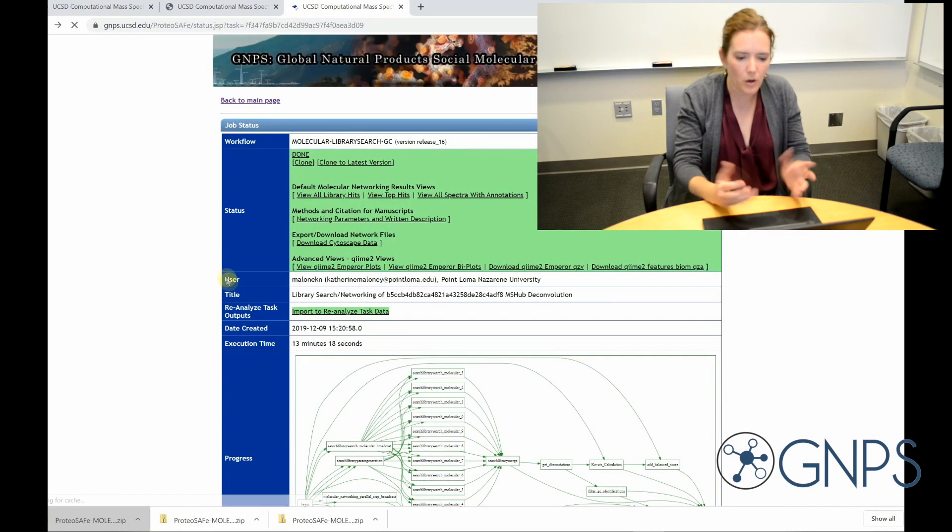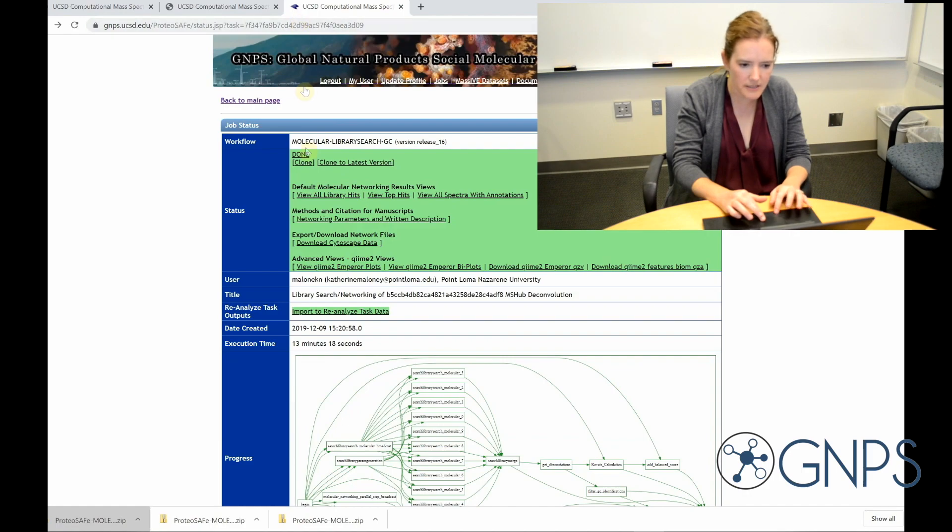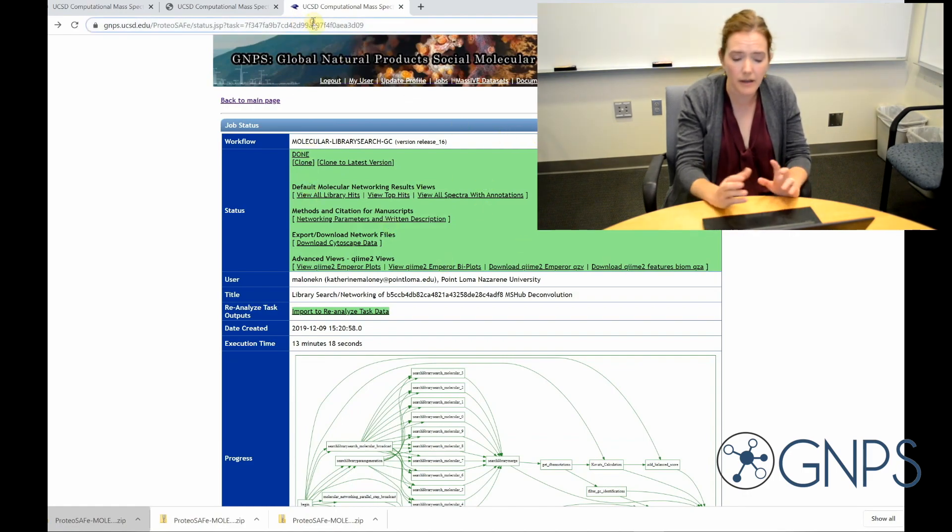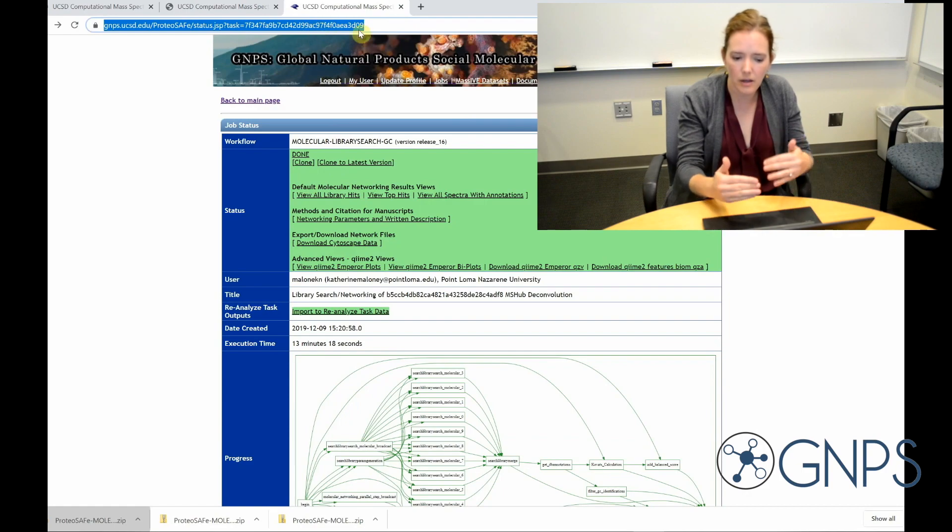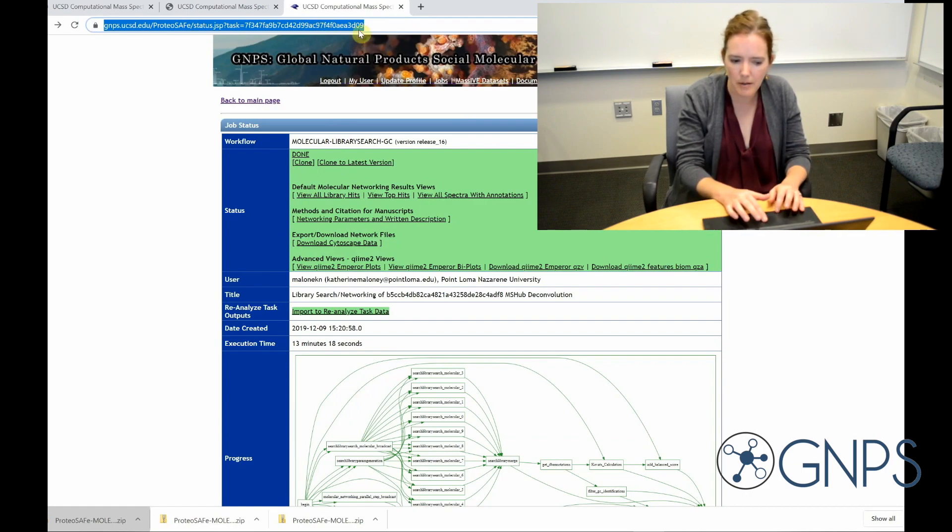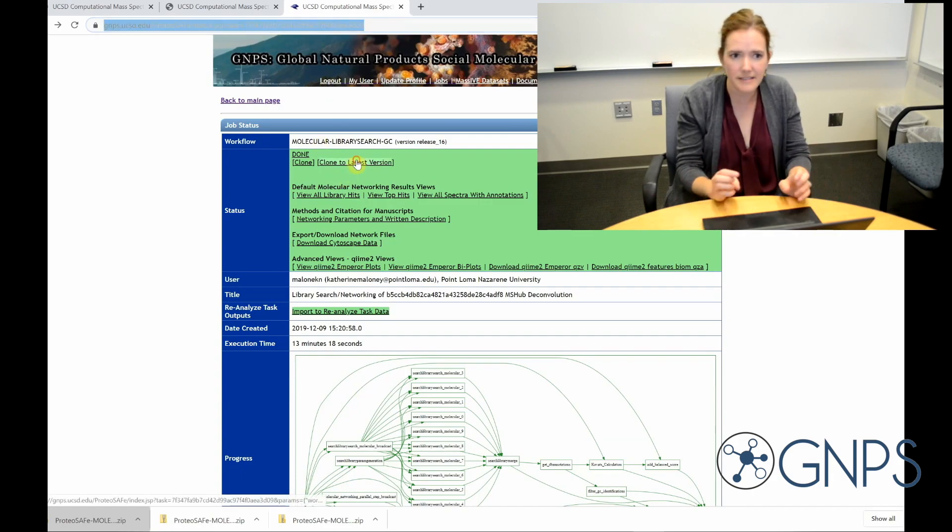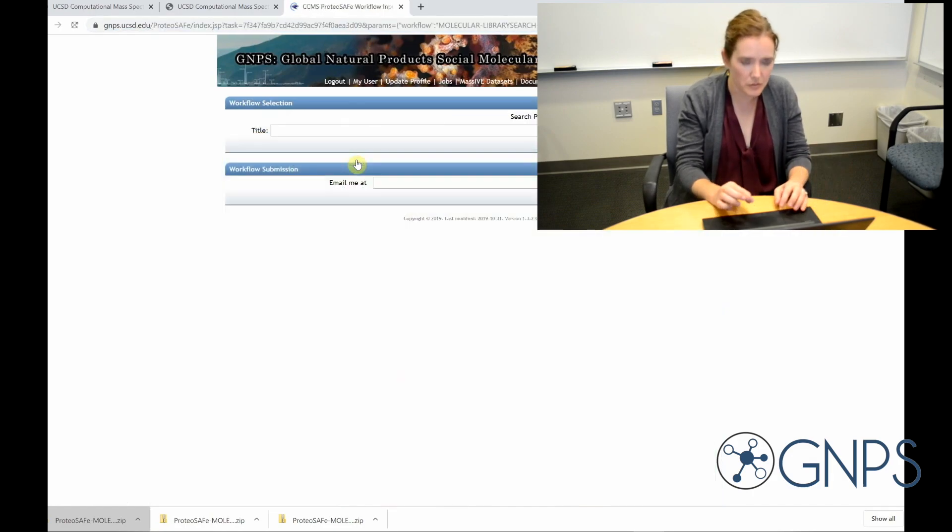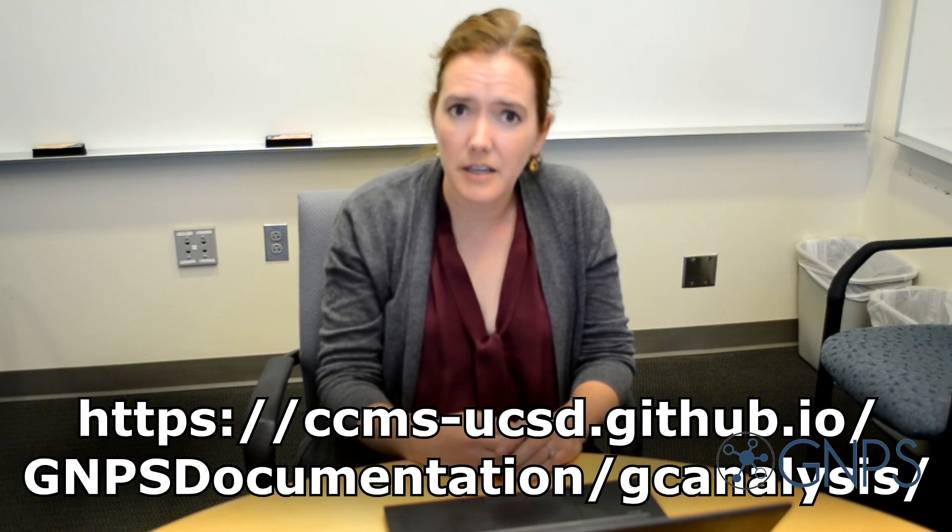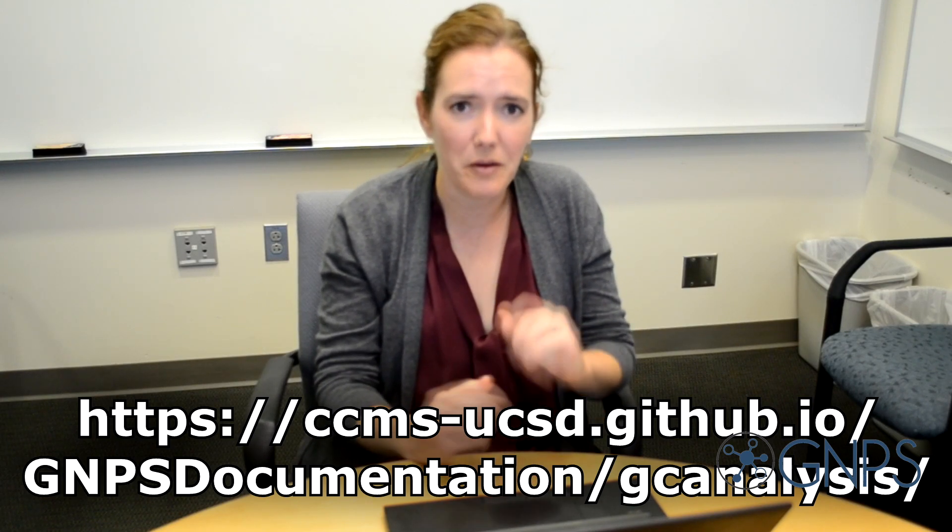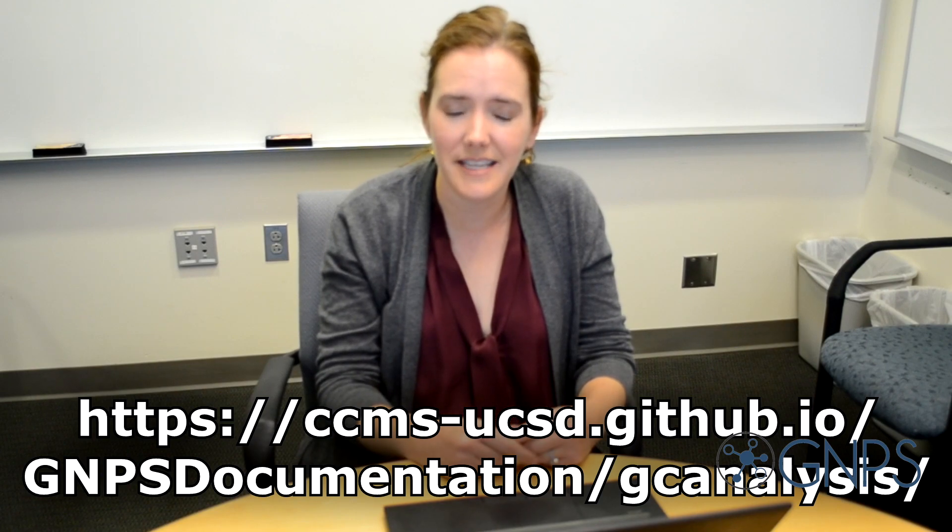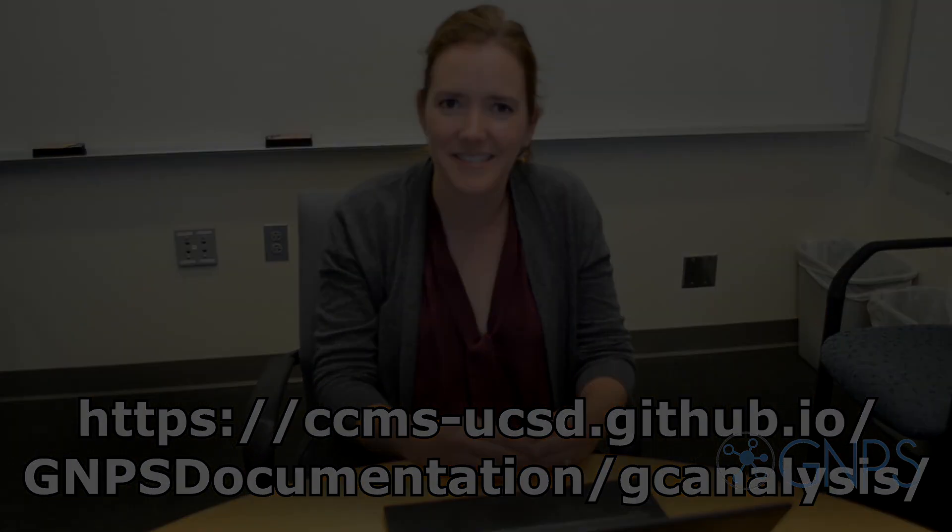And lastly, if I want to work with a collaborator or potentially modify this analysis, this link here, I can share with anyone. They can look at my job and then they can also clone the job, changing some parameters around and then rerun it, which is really great. So if you want to learn more, I strongly encourage you to follow along through the detailed tutorial at the link shown on your screen. And I hope you have lots of fun with GCMS on GNPS.